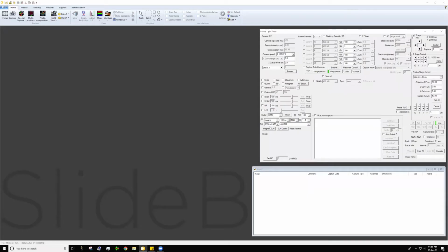Step 1. Ensure that the correct mask is set. This is usually 0.55 by 0.493. Step 2. If using the preset modes, select this checkbox. Select the correct lasers, exposure time and ROI. Tick on guides if you'd like to use them. Step 3. Ensure that the dither is on. The box next to X Galvo range should read a positive number, usually 2 or 5.